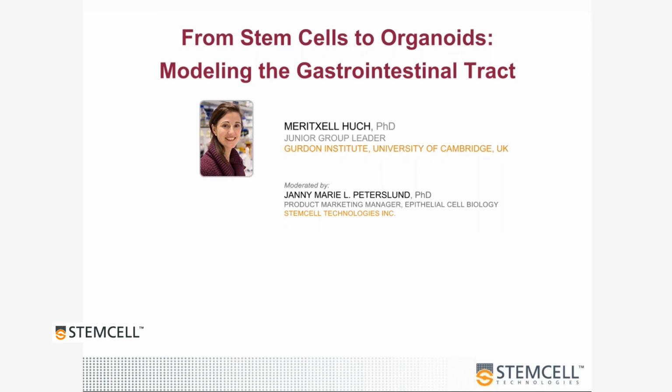And when you say 20 million cells, how many mini-guts would that more or less average? Do you know? For us, that was around 6 plates of 6 well. Wow. I don't know if that gives an impression, something like that.